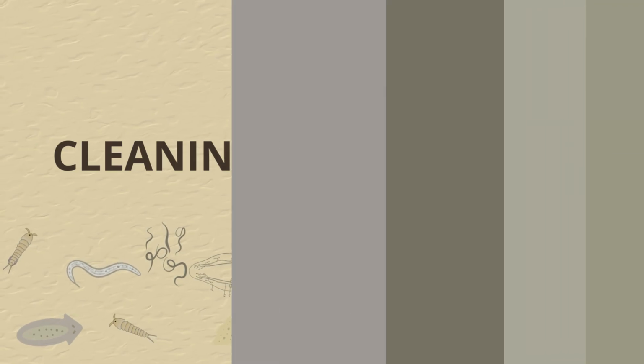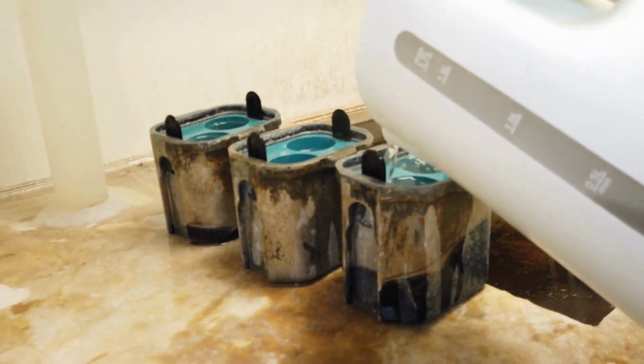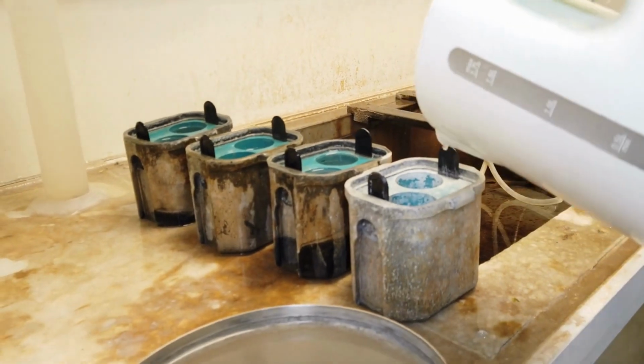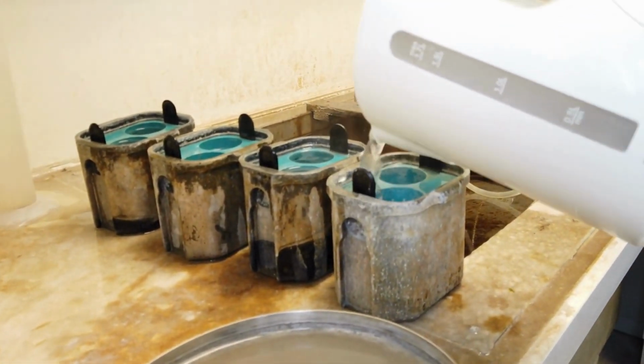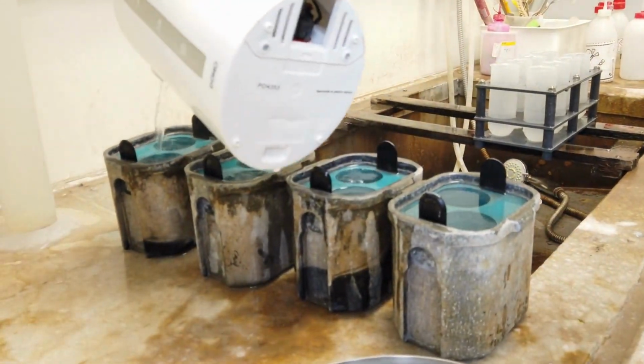Cleaning the materials. All the materials that were used with Ludox should be cleaned with warm water. Ensure that tube holders are not covered with a layer of dried Ludox. If any material is covered with Ludox, it needs to be cleaned with a 30% nitric acid solution.